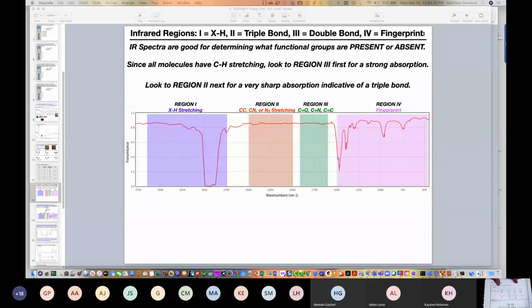So you're probably thinking, okay, they each have a carbonyl, right? We've just eliminated the ones without a carbonyl. The other thing we recall is that the carbonyl was 1 degree of unsaturation, so we still have 1 degree of unsaturation to account for. Can we eliminate any of these if they do not have a second degree of unsaturation? Yeah, we can eliminate B. Well, there's the one, and this would be the second one. Oh yeah, that's right, that actually does have 2 degrees of unsaturation. So this also has 2, and H also has 2.